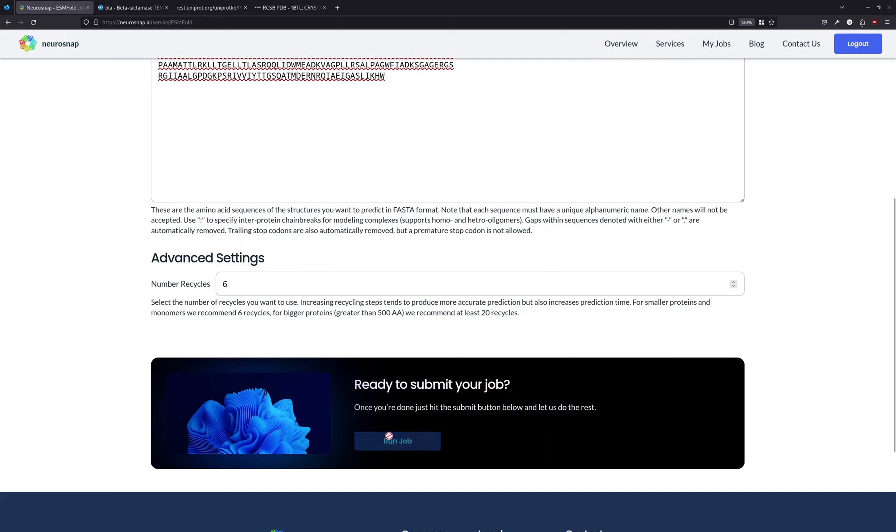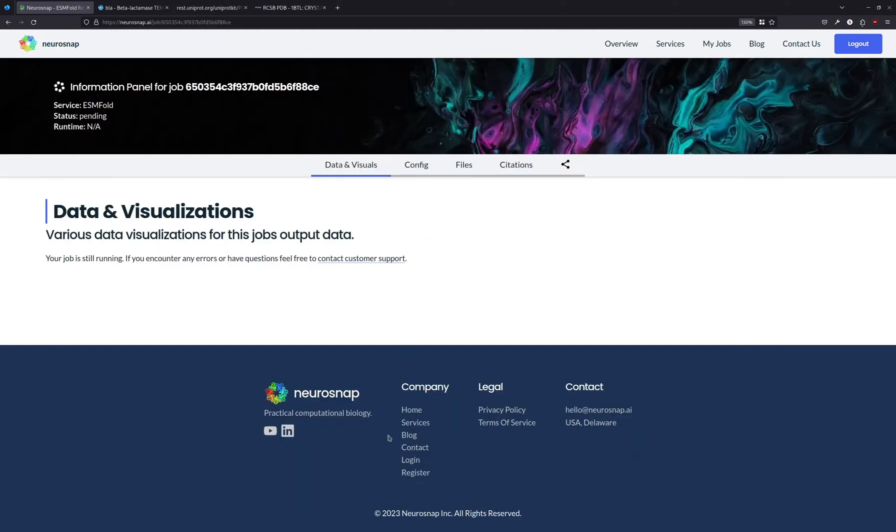Then we're just going to run the job. This is going to take a little bit of time, usually a couple minutes, and after that we're going to resume the recording.